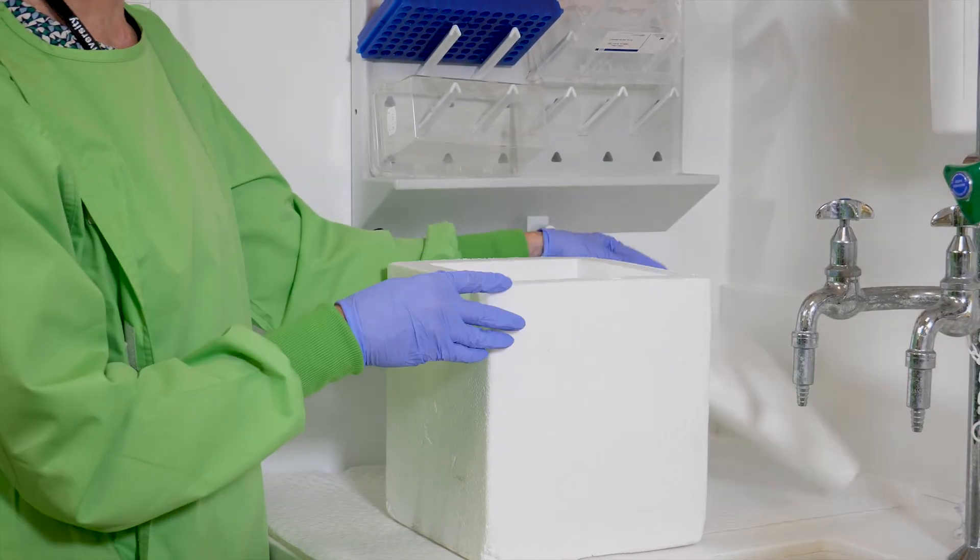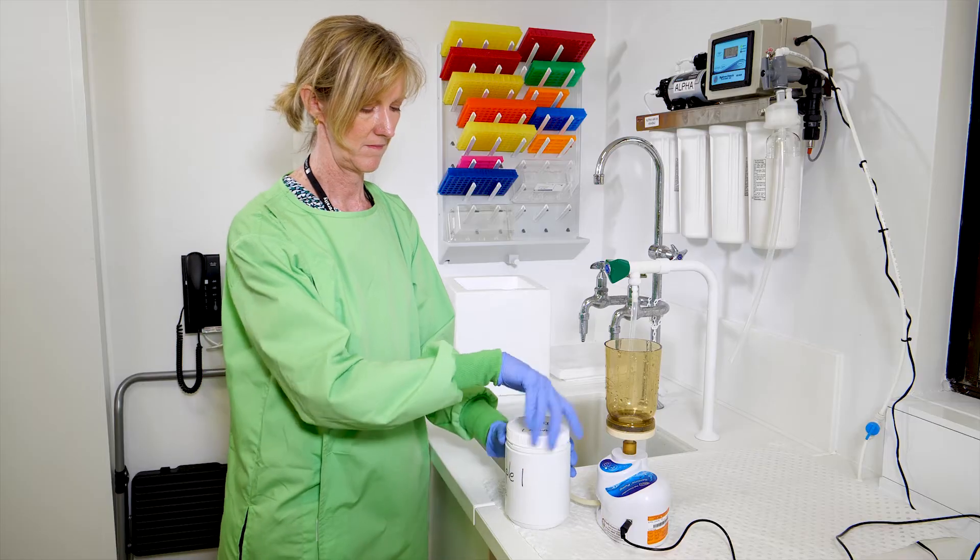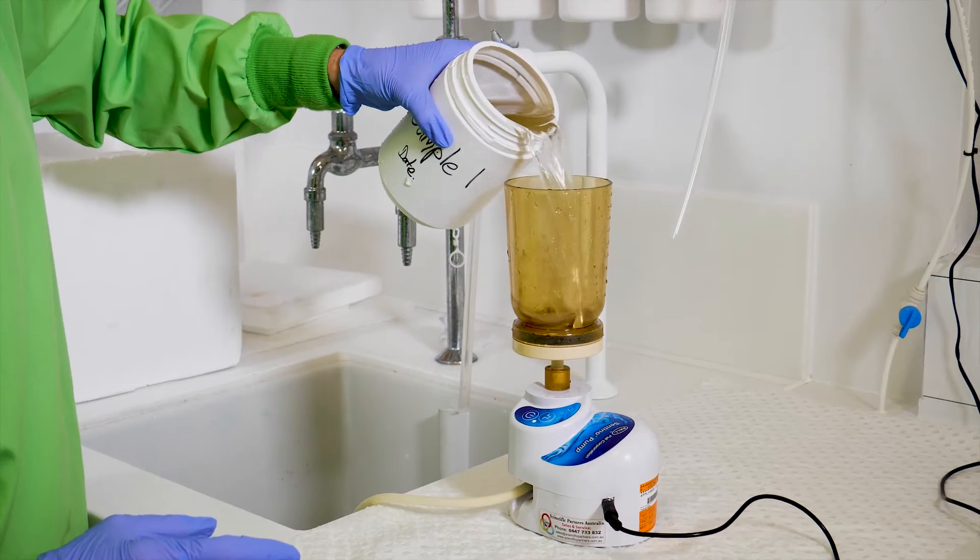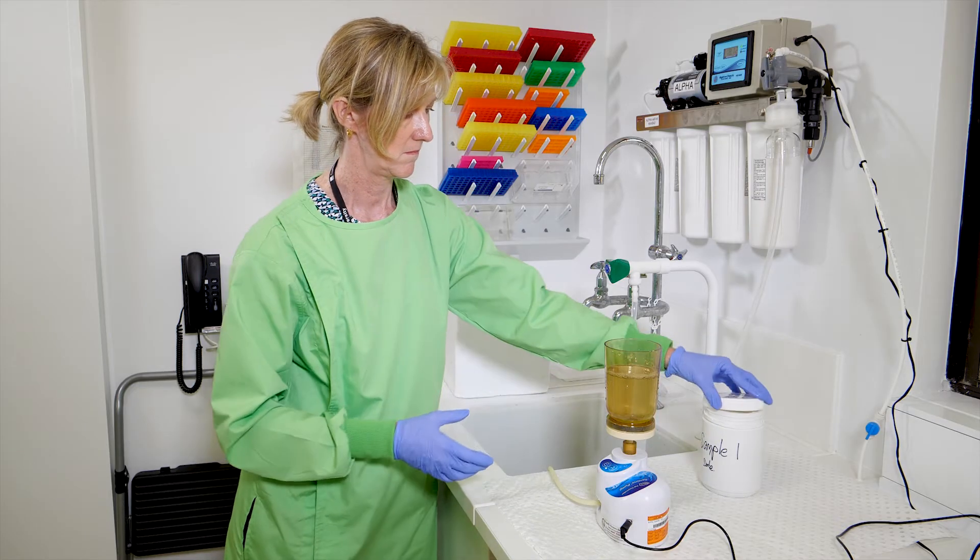Now that your pump is ready, take your first water sample to be filtered from the cold storage. Remove the lid and pour the liquid into the funnel to approximately three quarters full. Replace the sample lid and turn the pump on.